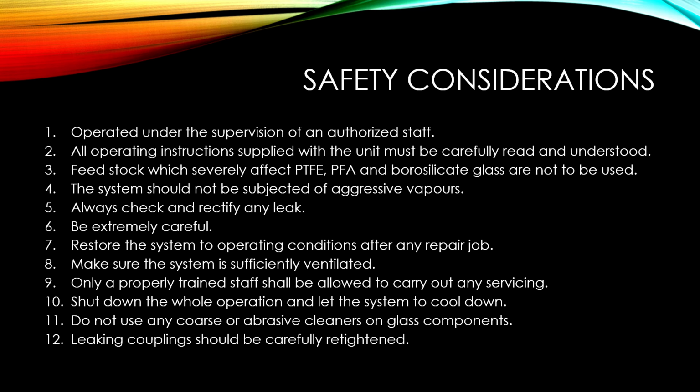After that, before any servicing, shut down the whole operation and let the system cool down and be properly ventilated. Do not use any coarse or abrasive cleaners on glass components. Leaking couplings should be carefully retightened. Replace any gasket or seal if necessary.